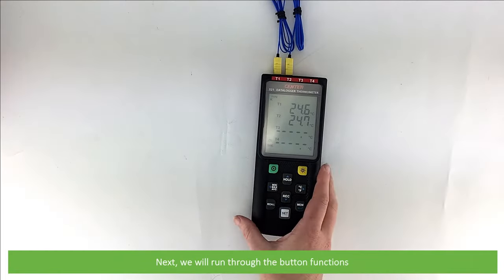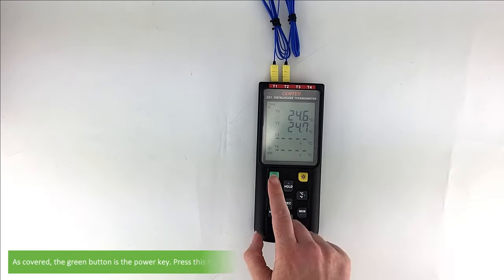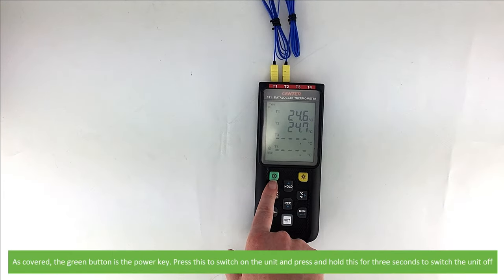Next, we'll run through the button functions. The green button is the power key. Press this to switch the unit on, and press and hold for 3 seconds to switch the unit off.